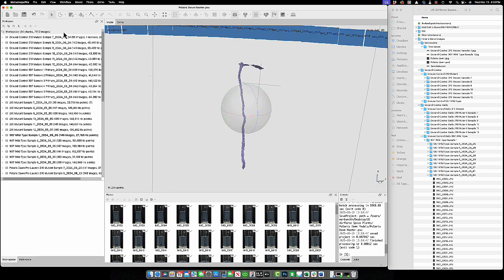Another thing I've been doing is, because these point clouds are very good for us, I can actually take this point cloud, pull it into Blender, and reproject the pathway that I need, which is something I will probably show in a different video. I realize this video is getting kind of long, but I will pull these into Blender.